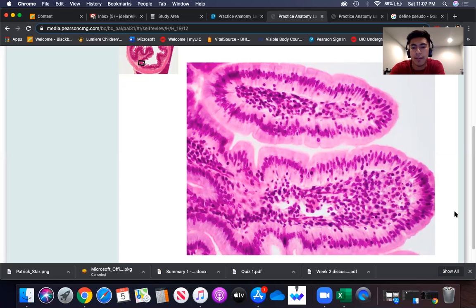As you can see, there is a very thin basement membrane here, which all of these long, tall cells will attach to. If you look at here, there is a consistent level of the nucleus. This is very important for later, and I'll explain why. And very simple explanation, they're tall columns or cells that are responsible for absorption.